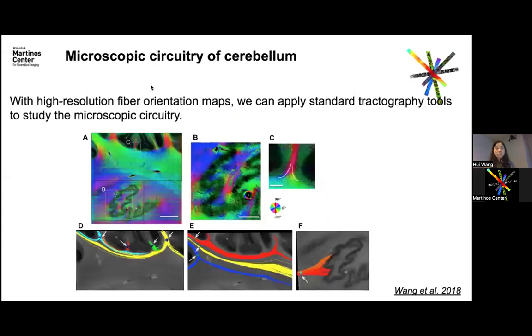Okay, so with this technique, we can immediately apply a traditional tractography tool to study the connectivity. In the slides, for example, if we put seeds here, then you can follow the fiber orientations and see different fiber tracks, different trajectories, some splitting from one point and some converging at points, like between the deep nuclei and the deep white matter here.